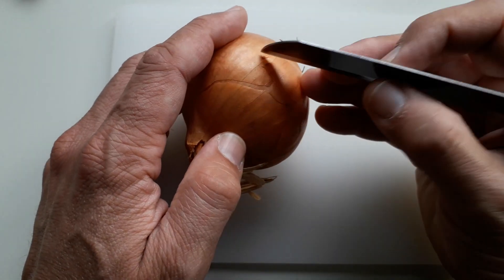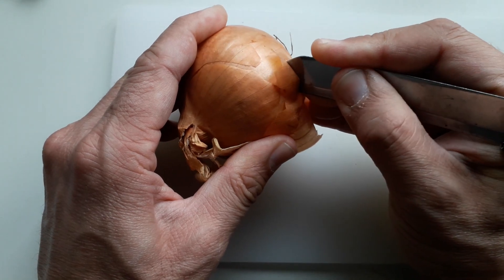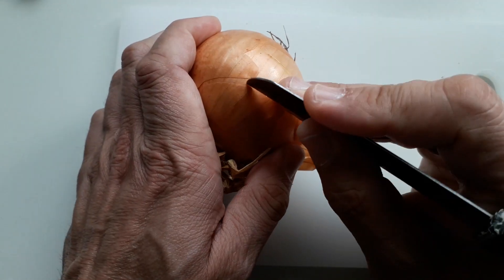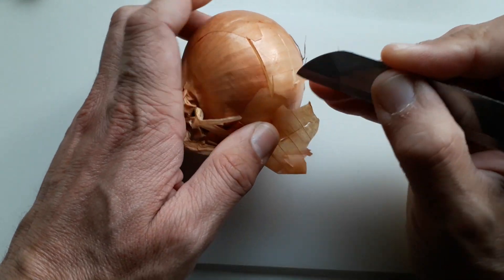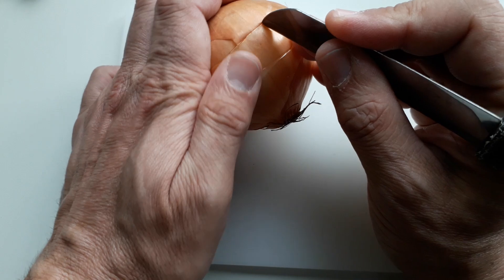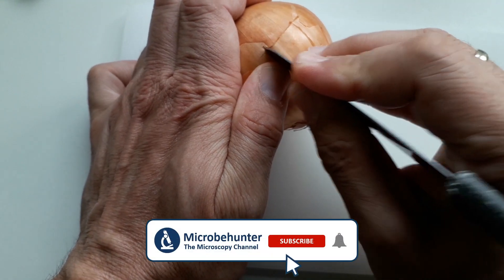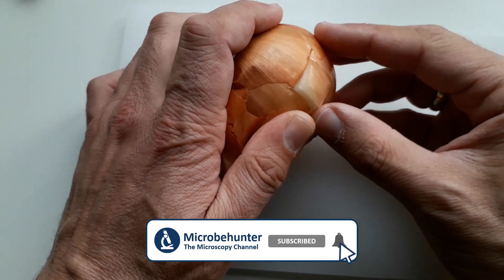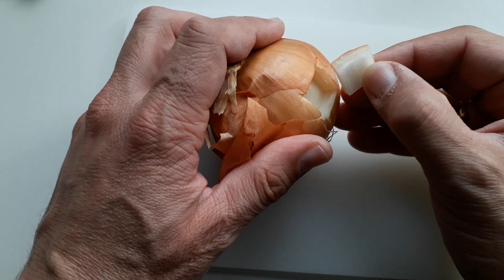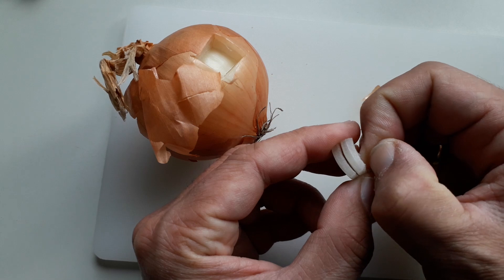There is absolutely no need to chop apart the whole onion, so what I'm doing is simply cutting out a little square just the right size to be placed under the microscope — a parallel cut, then turn the onion 90 degrees, another parallel cut, and I'll be able to get some of the onion layers out.